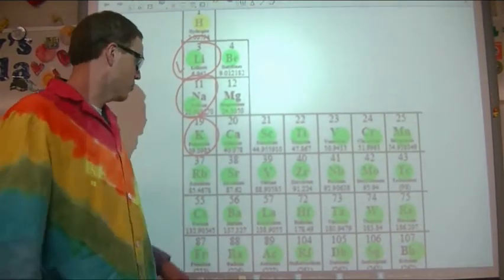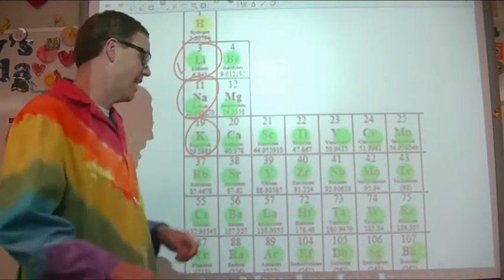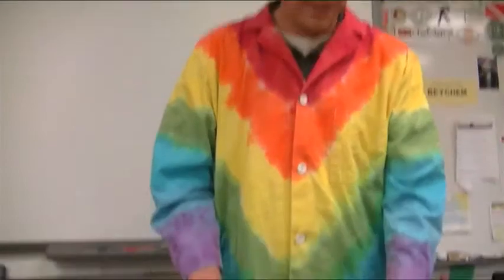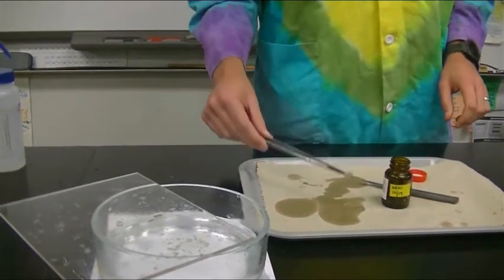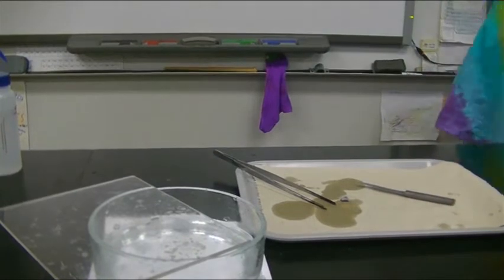I unfortunately drew the short straw, so I have to do this. Makes me really nervous every time, and I don't like it. We're just going to get this over with. All right. Little bottle of potassium, again in mineral oil, so it doesn't get to play with any of the water vapor in the air. Here we go. I'm going to grab a moderate-sized chunk out of here. Okay, there we go. Put the lid on. Get rid of this.